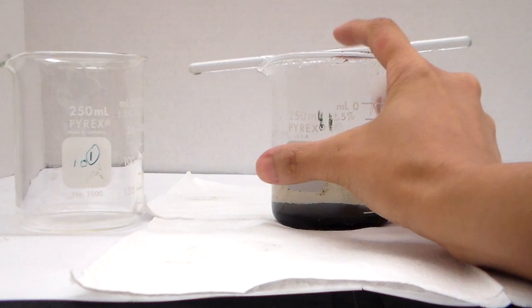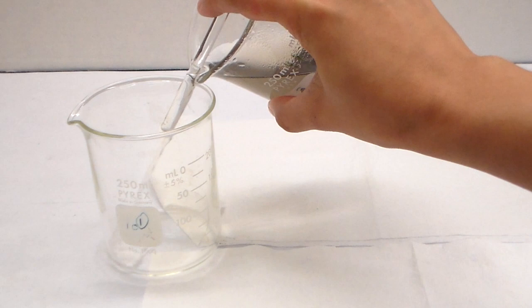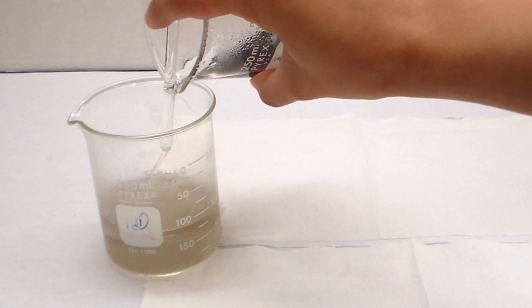Set the stirring rod on top of the beaker, then carefully pour out the liquid without disturbing the solid. Try to get as much of the liquid out as possible without disturbing any of the solid. If you have a little bit of solid transferring along with the liquid, that's okay.